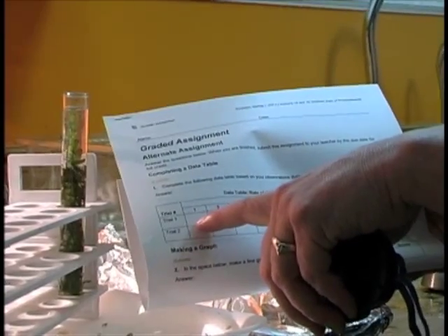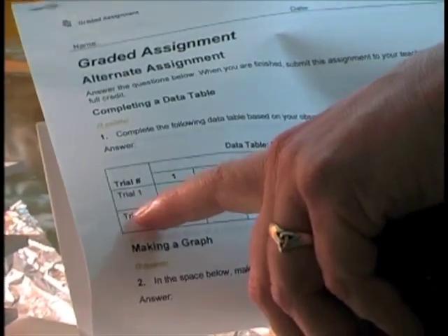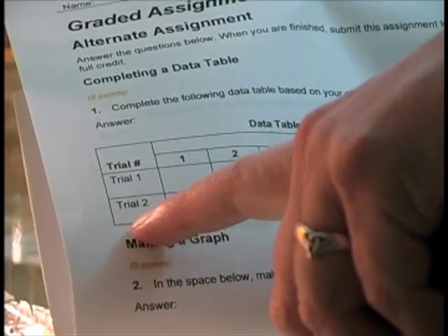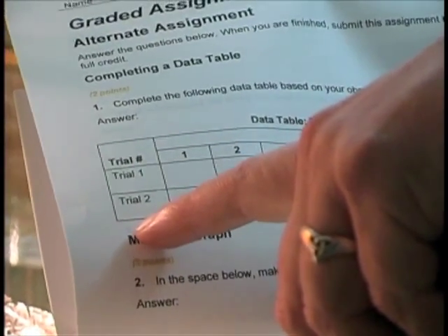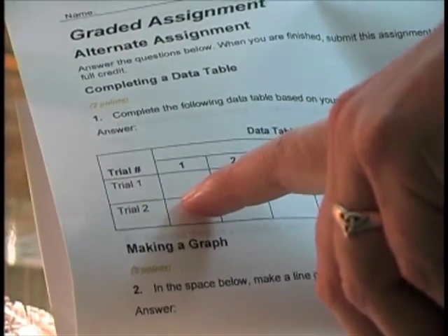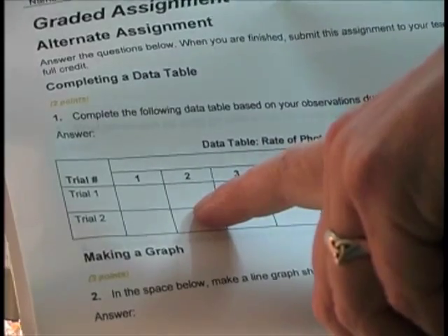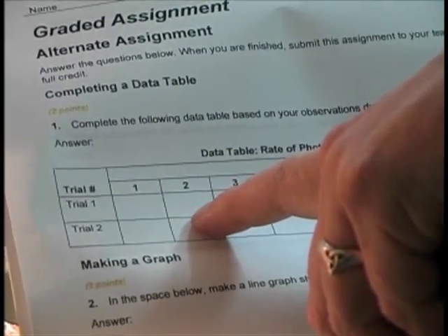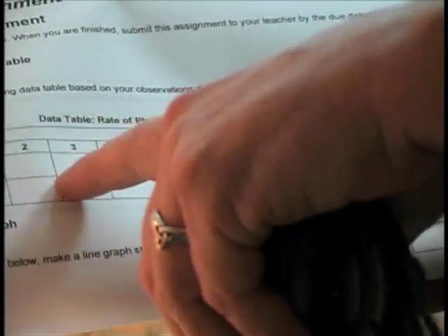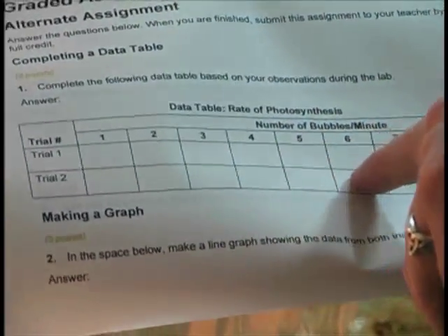After timing for one minute and counting the bubbles, I'm going to put them in the column for trial one. Trial one, we're not going to have a strong light on. Trial two is when we'll either put the tube in a sunny window or use a very strong light on the test tube. I'm timing for one minute and writing the number of bubbles in each box. I'll keep going for 10 continuous minutes, writing down the number of bubbles every minute.